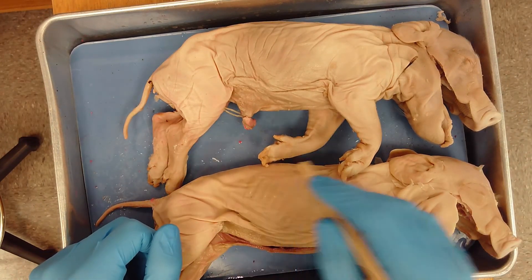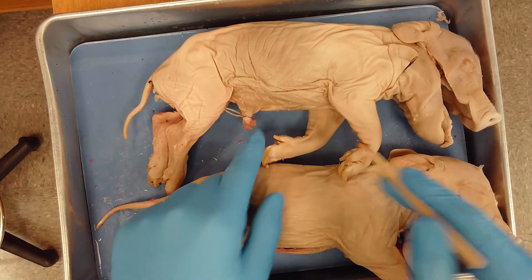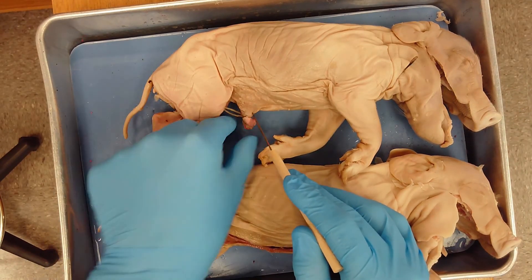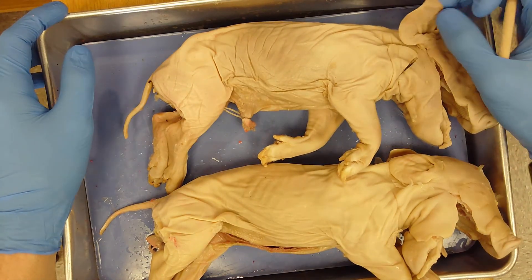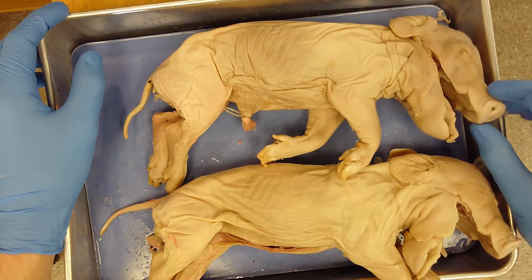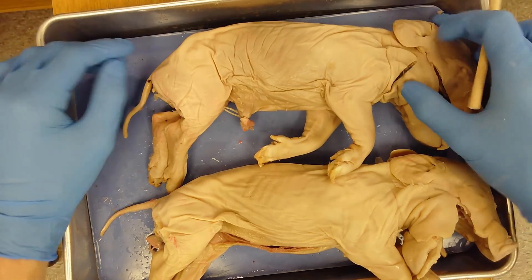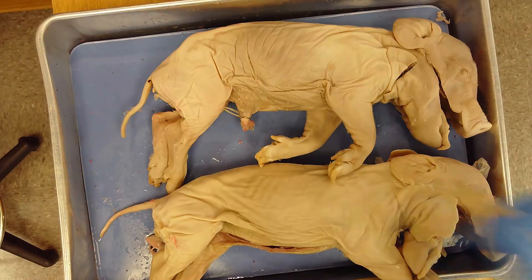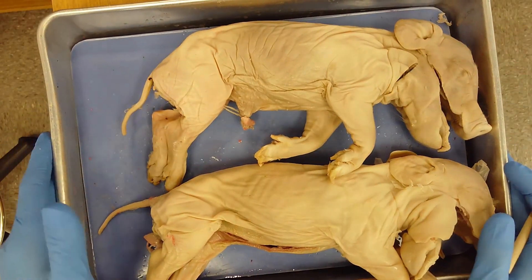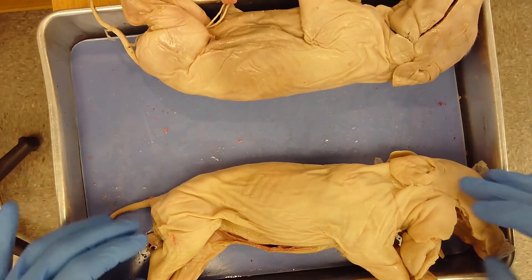Other external anatomy includes four legs. In between the legs we have an umbilical cord. We have ears called pinna, eyes, two nostrils called nares, a mouth, and a tail. That's about it for external anatomy.